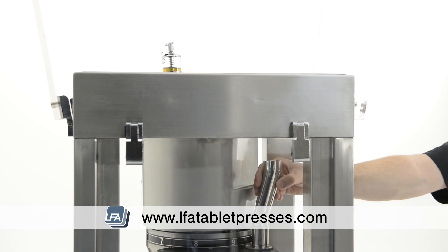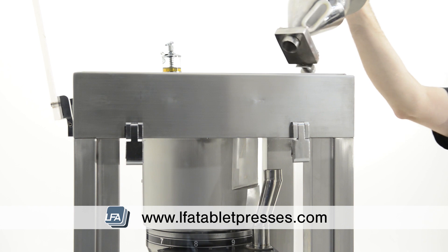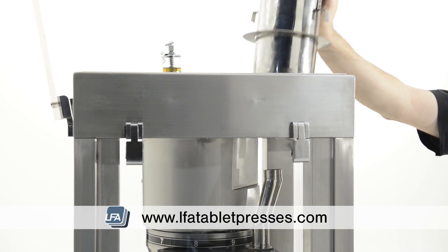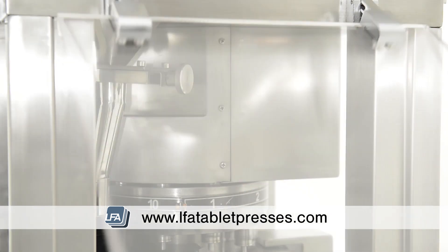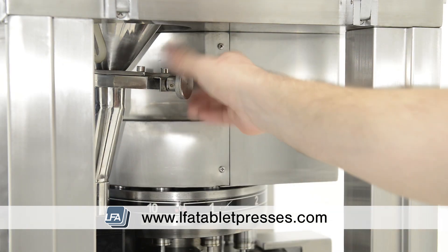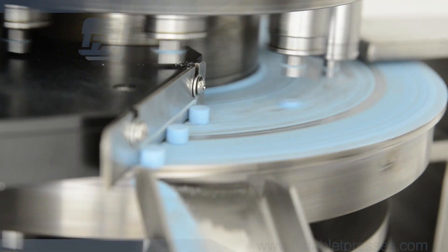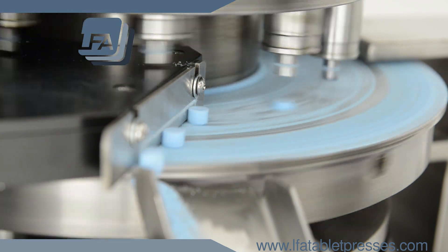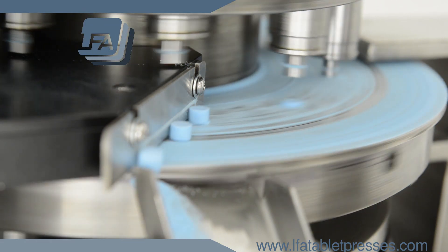We can now replace the hopper extender through the side of the machine and the hopper through the top of the machine. You can now adjust the flow adjuster on the hopper to release the formulation down into the force feeder. For more information, products and guides, please visit www.lfatabletpresses.com.